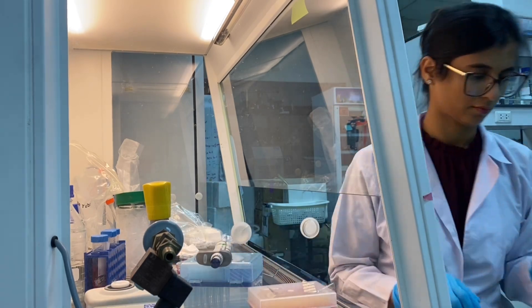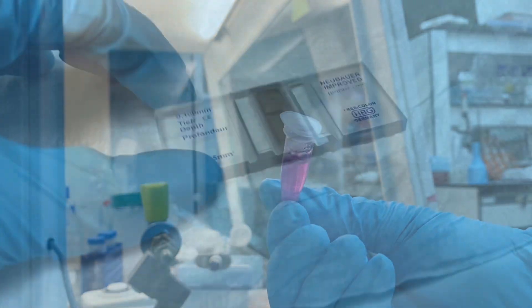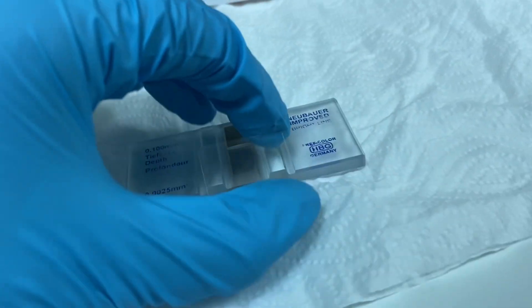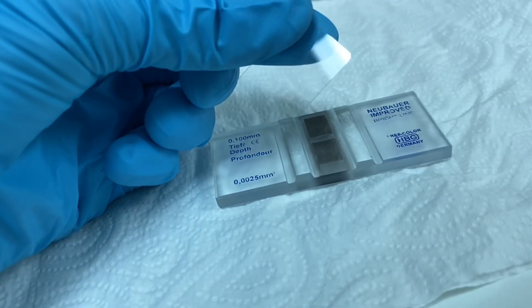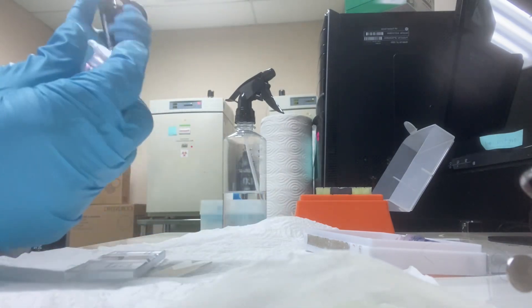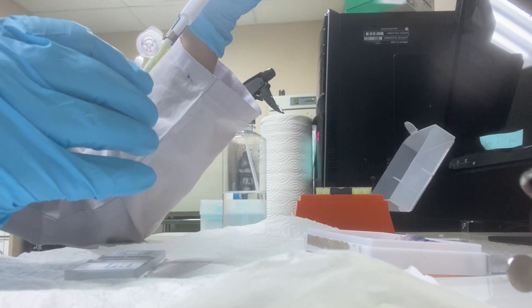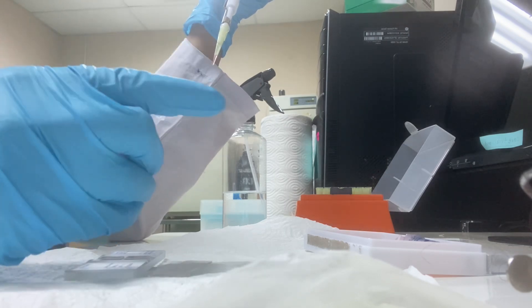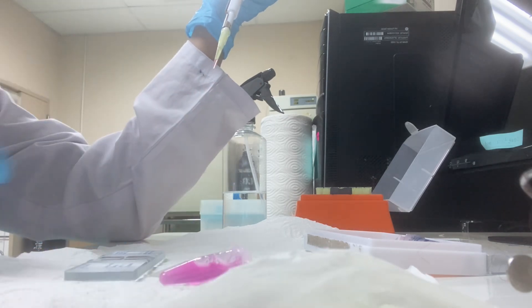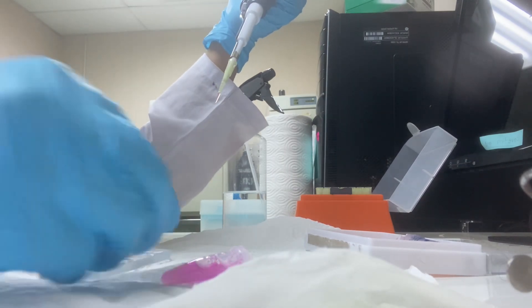I have my sample for cell counting ready. To count the cells, I'm going to use a hemocytometer and I also have a cover slip. I'll use about 10 microliters of my sample and put it in between the hemocytometer and the cover slip. I repeat this process three times so that I can take an average.